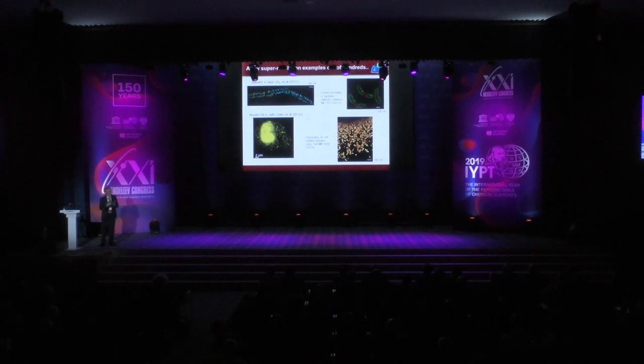These glycans are important for recognition between cells and interacting. They're elaborated in cancer and so on. And this is a super-resolution microscopic image of the surface glycans that have been detected by using methods from Carolyn Bertozzi to attach fluorophores on specific glycans. You can see that they're hollow tubules, extending out from the membrane, and you can observe the shapes of these structures.